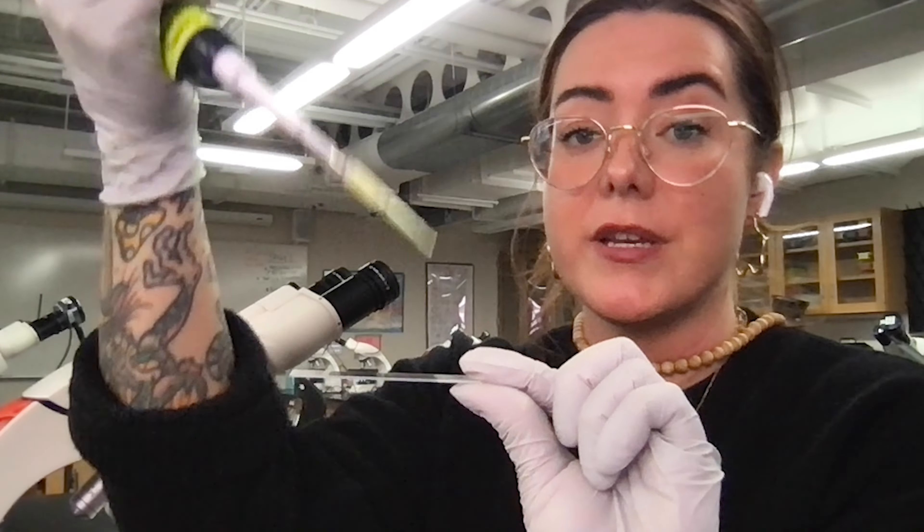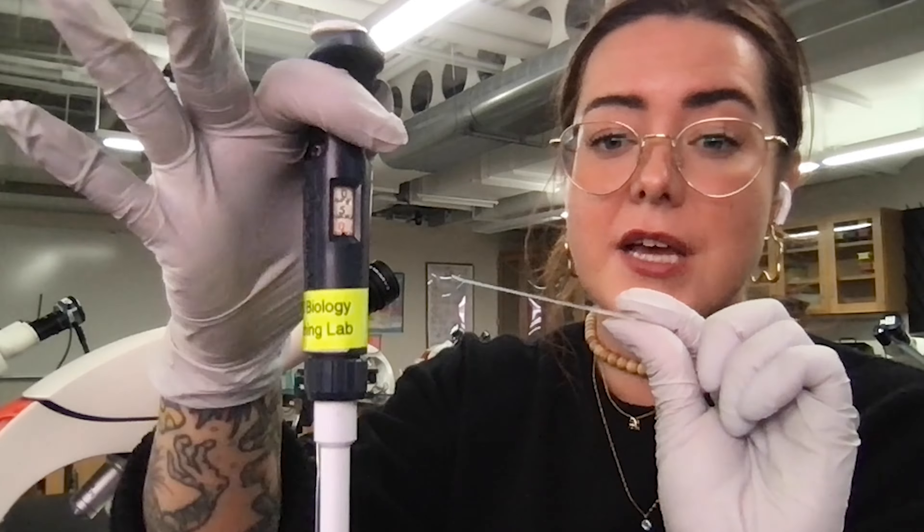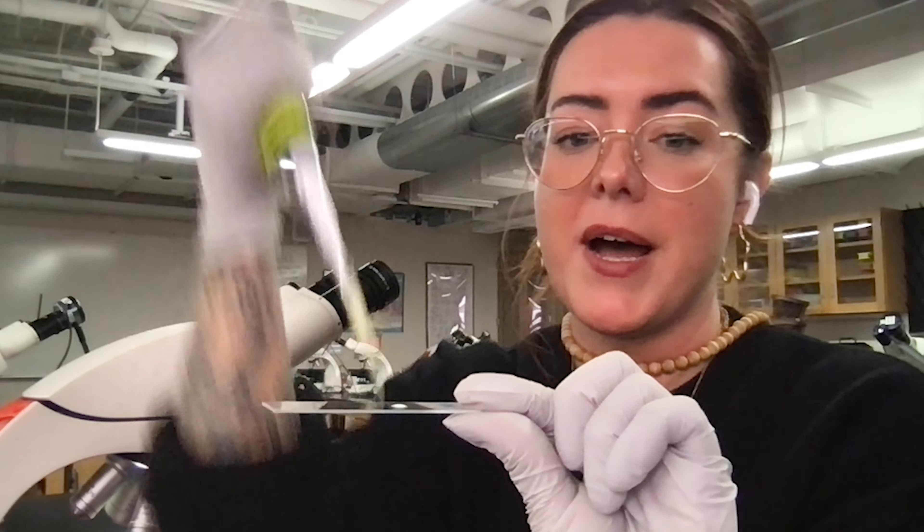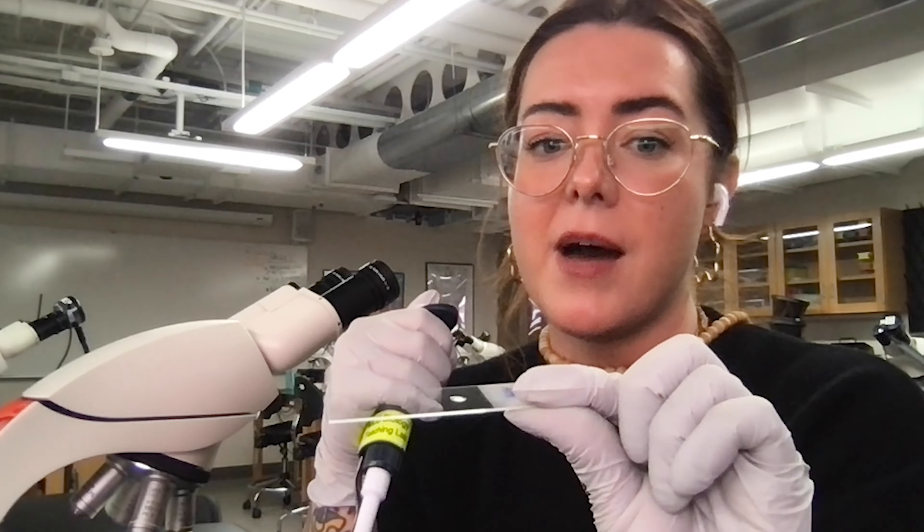So to make my wet mount, I'm going to take five microliters. You can see I have my P20 here set to five microliters, and I'm going to drop my specimen right down on the top of this slide.